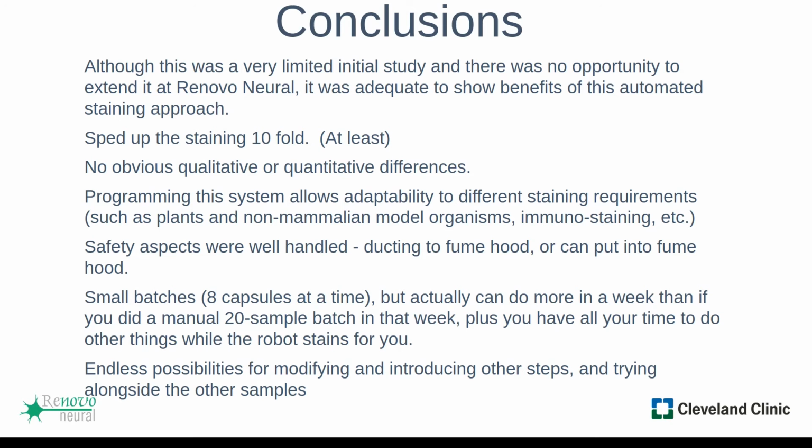Also, since it's 2020, you may not be able to be social with people in your lab. But if you know they're about to use the ASP1000 system tomorrow, you can edit the protocol they're about to use and add links in the texts or the emails. The link can go to a picture of their favorite animal to show that you still care about them and you're thinking about them. Because the world needs more kindness, even if it comes from a robot.